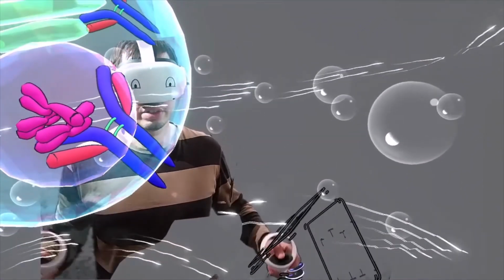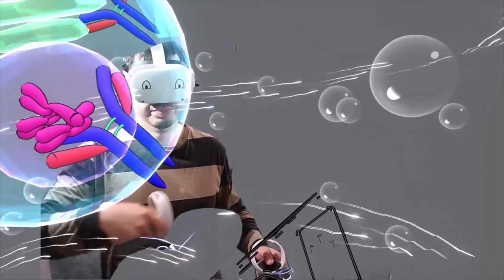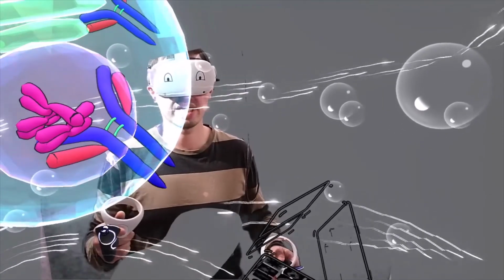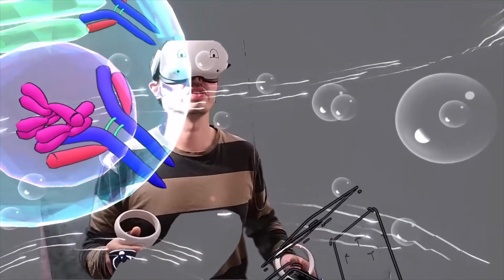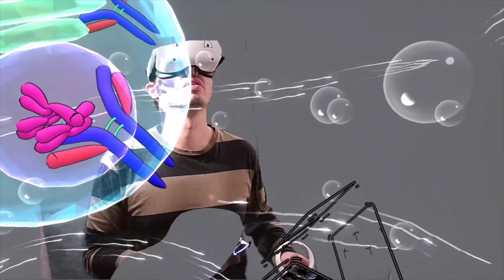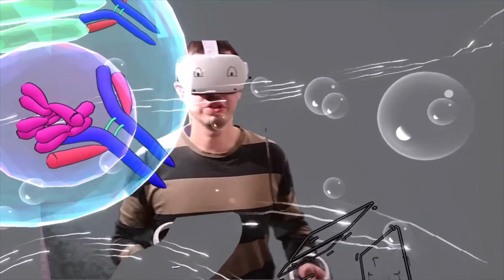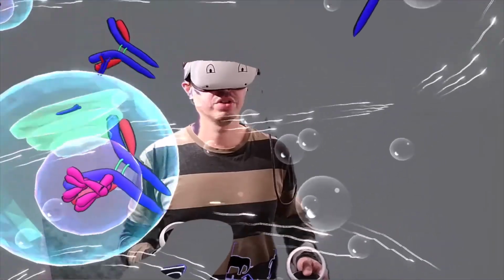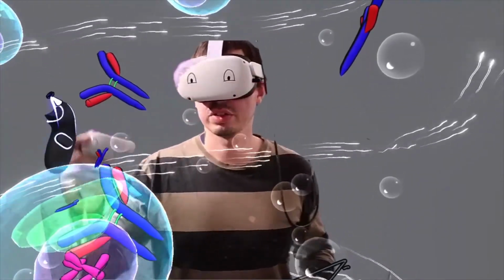Inside it, there's mechanical agitation, stirring, which allows for the nutrients and gases to mix inside the reaction medium between your cells to nourish them, allowing them to produce the antibody. There, for example.